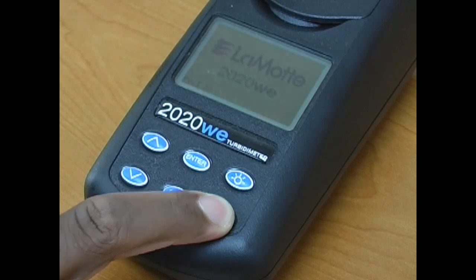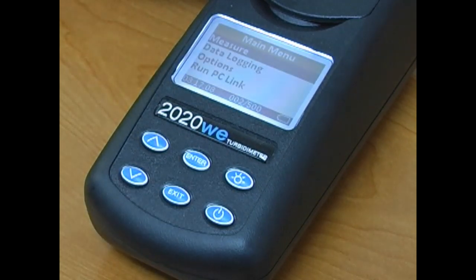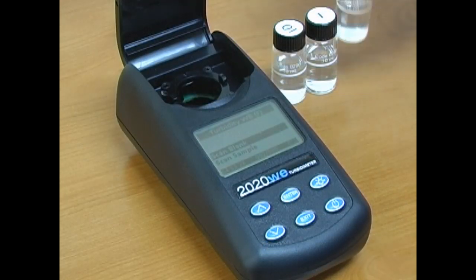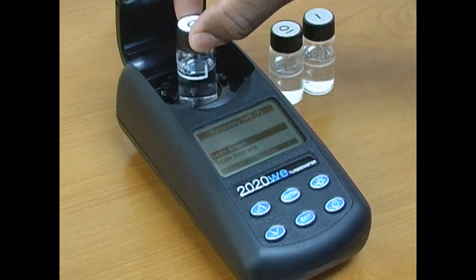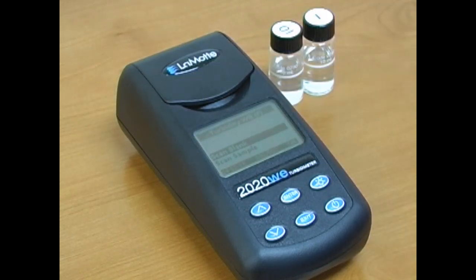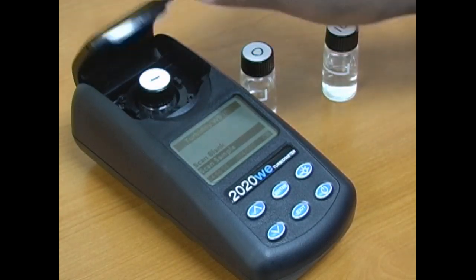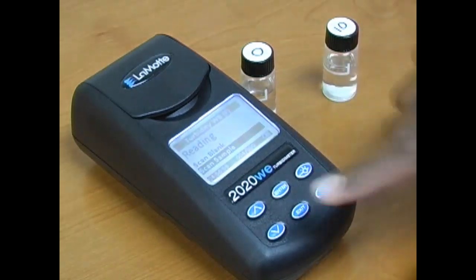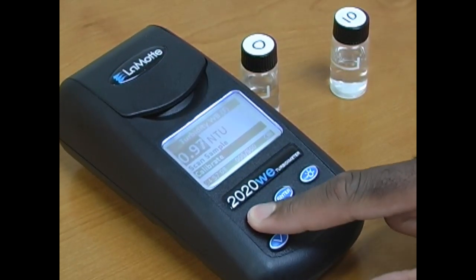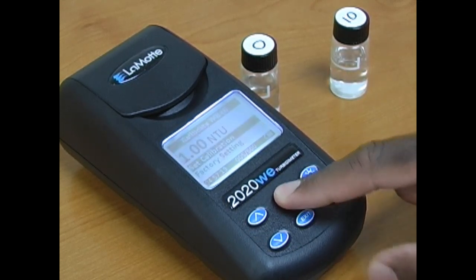Press the power button to turn the meter on. Select measure, then select turbidity blank. Insert the blank making sure to align the indicator arrows with the line on the tube. Close the lid and press enter. Remove the blank and place the 1 NTU standard into the chamber and press enter to scan the sample.